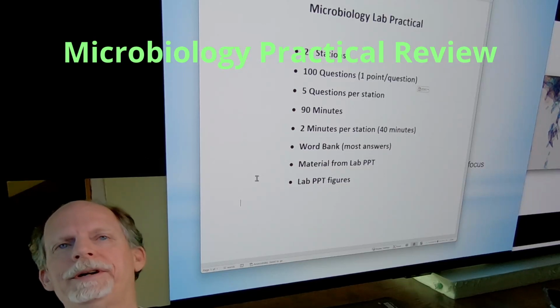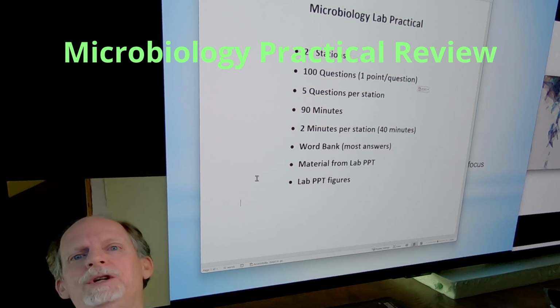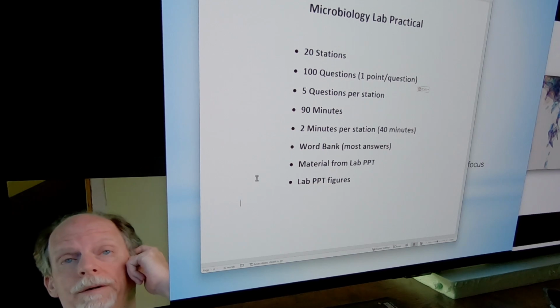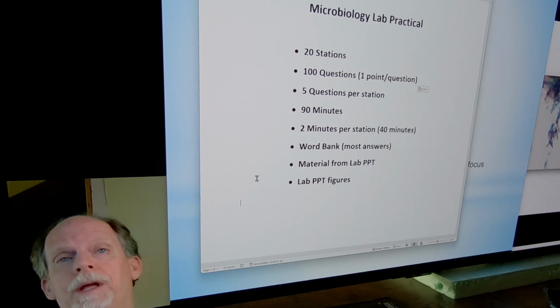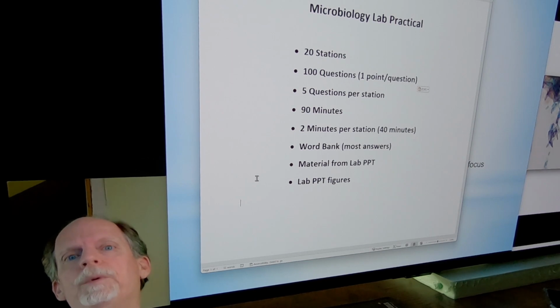Hi, Dr. Roos here. This is going to be a quick video on a review for the practical, and mainly this is for students that aren't taking me for my lab. Maybe an adjunct is doing your microbiology lab, and I just want to make sure that everybody is getting more or less the same sort of input for what to expect for the practical, because we give the same practical that the adjuncts teach.